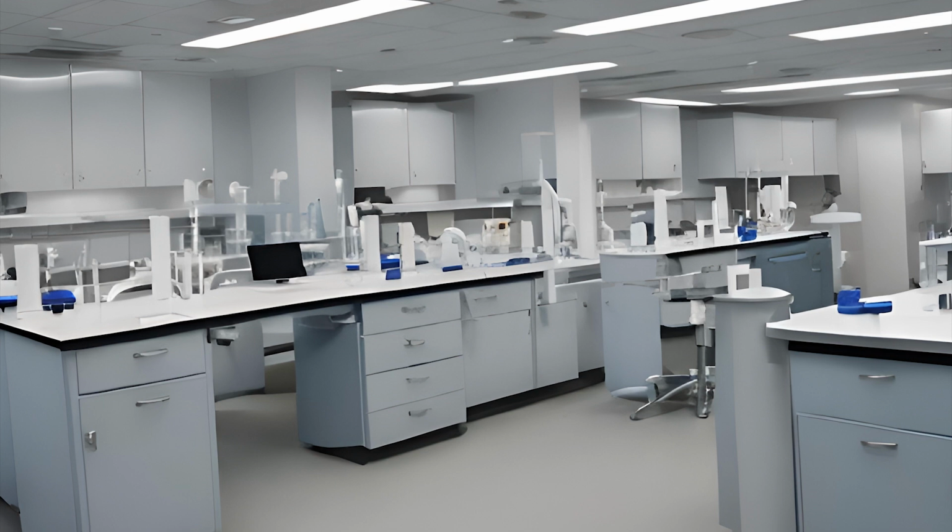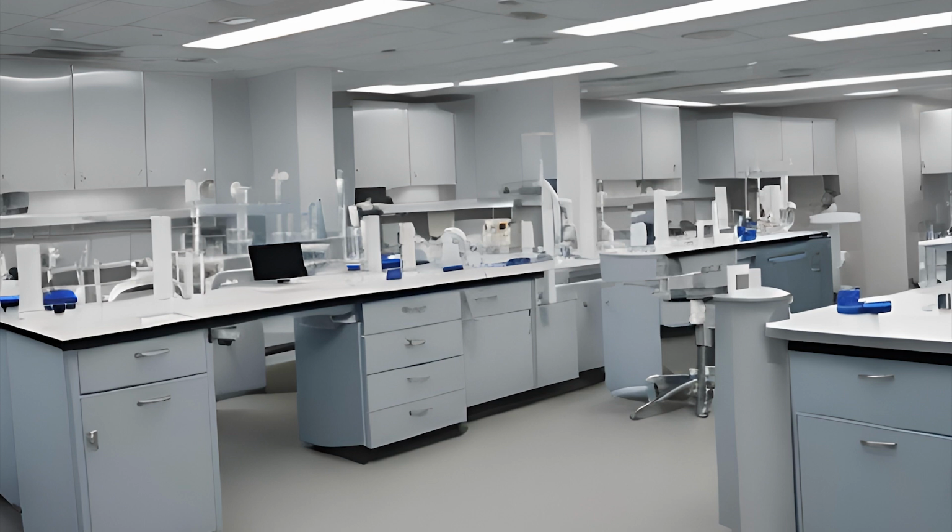Sometimes they get offended and try to blame you, saying it must have been your equipment that hemolyzed it. Centrifuges don't hemolyze samples, but phlebotomists do, and the phlebotomy procedure can. It is never the fault of your centrifuge for the hemolysis in a tube. The vast majority of the time, when it's not because of something going on in the patient's body, it's because of the collection technique.